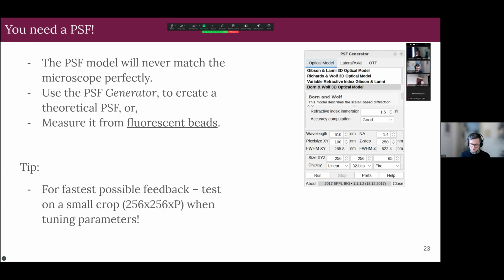It's one of those very tricky questions, very hard to say. I would check with another software as well, and if possible, try to query with some super resolution technique also, because it is possible that the algorithms can hallucinate a little if there is a noisy background.